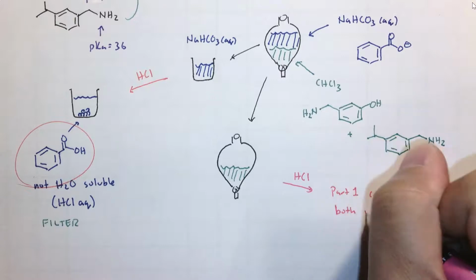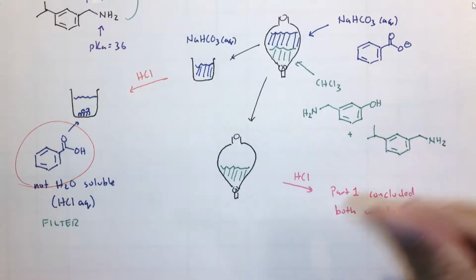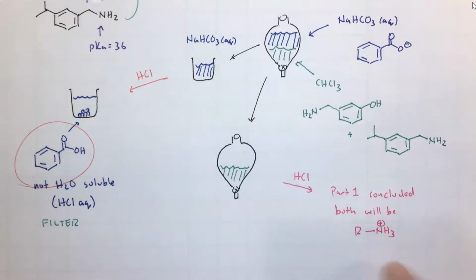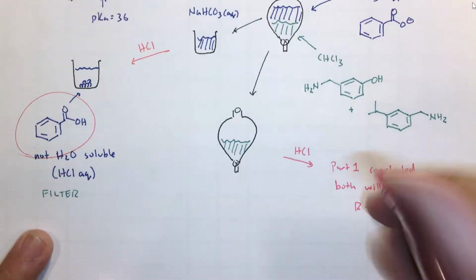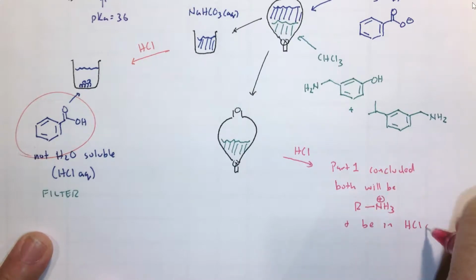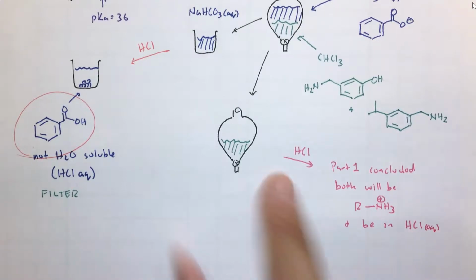Both will be, and we could abbreviate it, NH3 plus, and go into the HCl aqueous layer. We didn't get a separation when we use HCl.